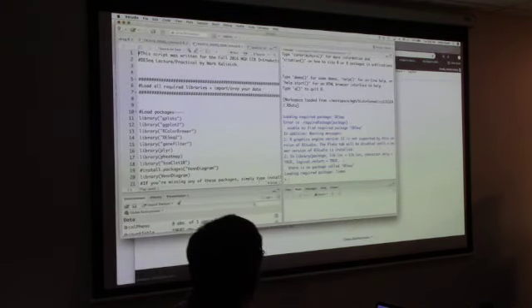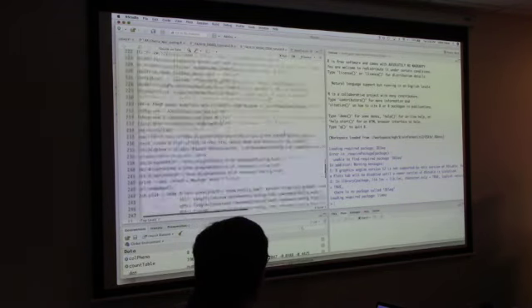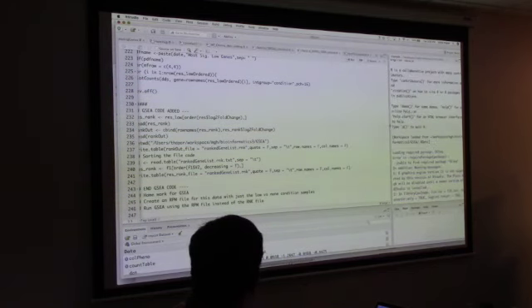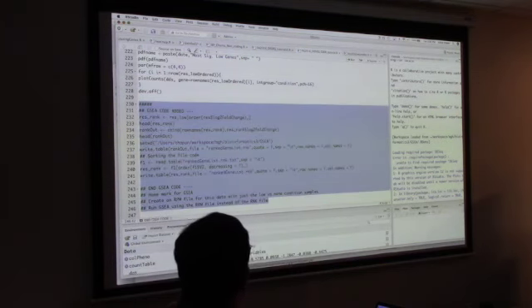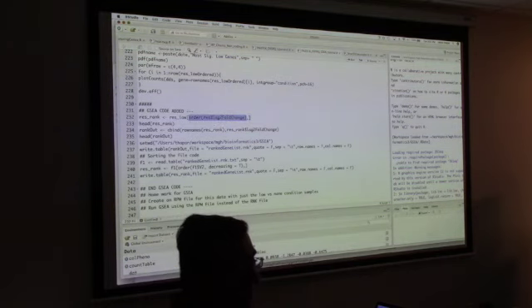It looks kind of like this. So this was written earlier by Mark for the practical, so it's the same practical file. What you want to do is scroll all the way to the end, and I have added this tag for code for GSEA, right? So when you are looking at your code here, you have this res_rank, which is a new variable that I create from ordering your log2fold change of your result object, right?